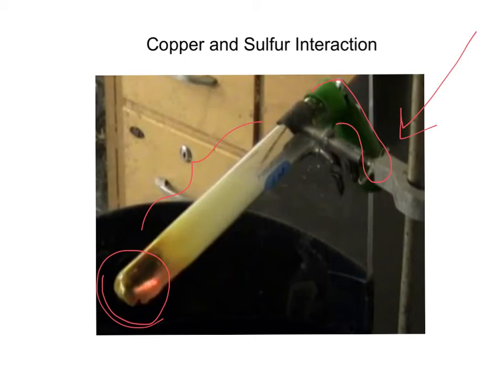Now you're going to allow the test tube to cool and then re-mass it. The directions say rubber sheet but we're using a balloon instead, just using the balloon's actual elasticity. You want to let it cool because if you don't, hot air currents will circulate around your balance and actually lift it — you can't weigh things accurately on a balance when they're hot. Check every five minutes or so with the back of your hand. It really shouldn't even be warm; it should be at or close to room temperature.